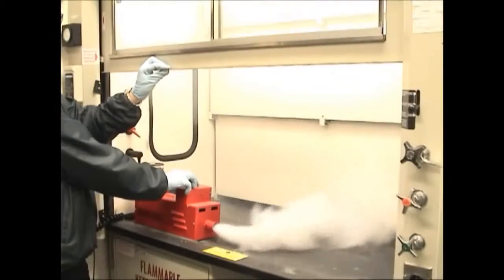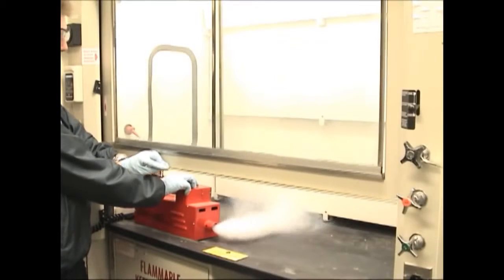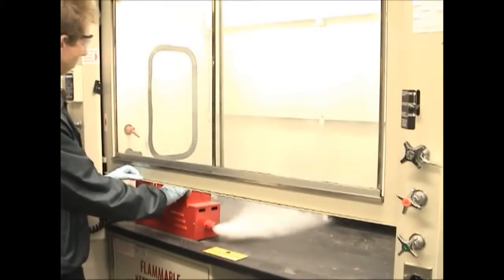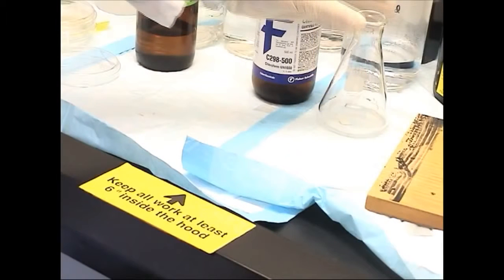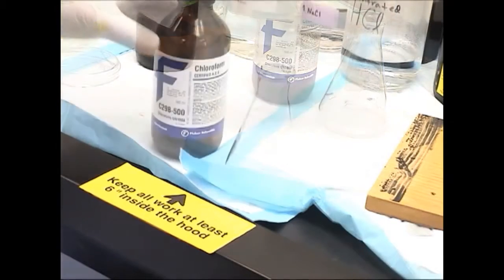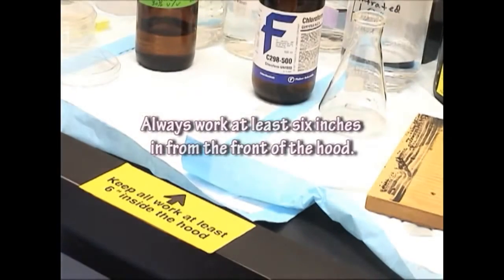When the sash is lowered, the capture appears better, but when the velocity becomes too fast, research samples can be sucked up the hood duct. Sashes properly adjusted and working further into the hood are the best way to protect yourself from inhaling hazardous chemicals used in the hood. Move extra equipment out of your way and always work at least six inches in from the front of the hood.